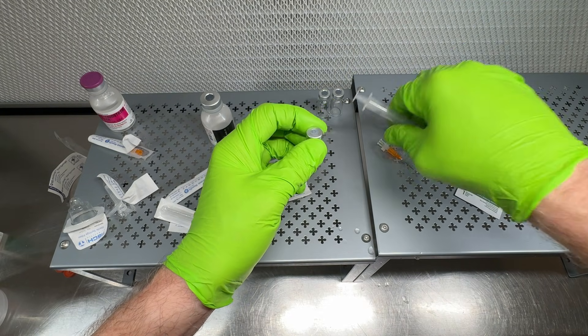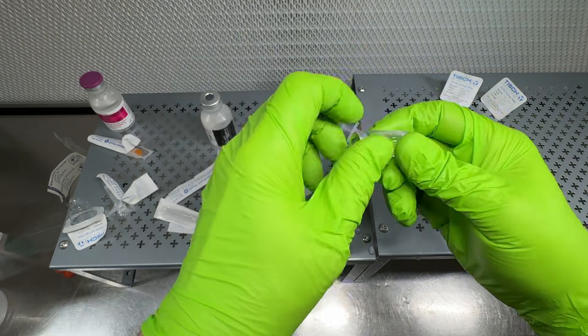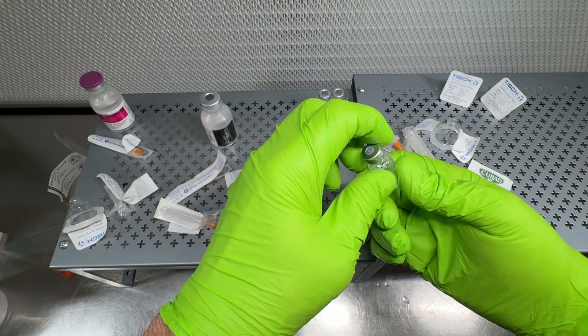That's pretty much it — we're done. Discard all the used materials and put the needles in a sharps container. That's your reconstituted and filtered peptide.